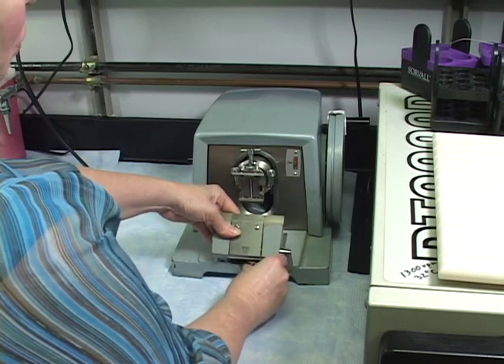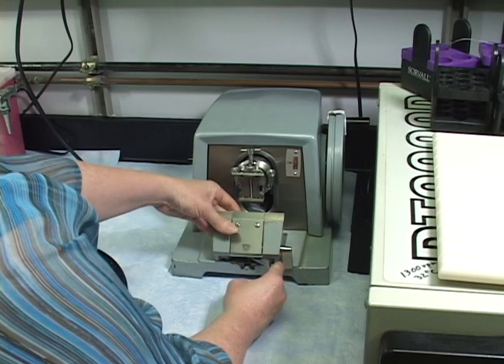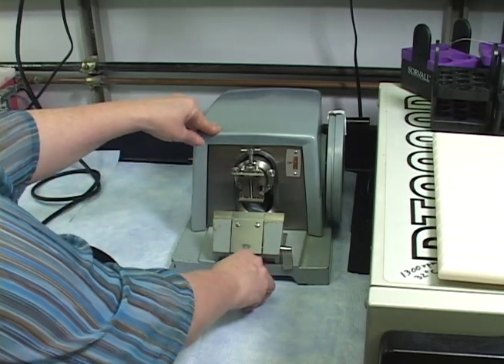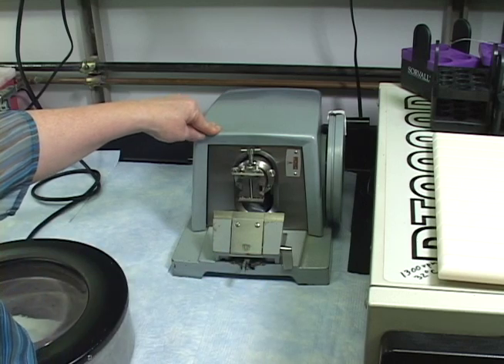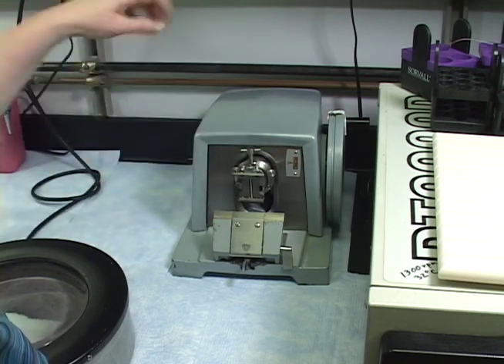And the only times you're going to vary from that is if somebody gives you precious tissue sample and you want to match what someone else has already done. That's the only time you're going to make more of a drastic change to the tilt angles of this chuck.